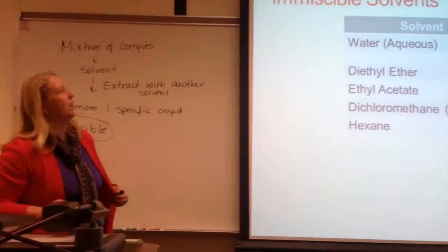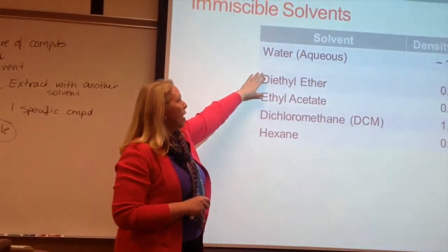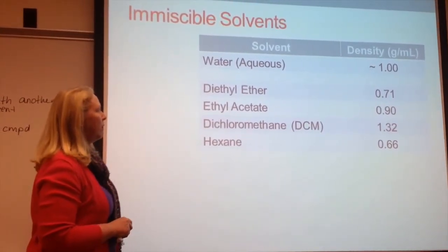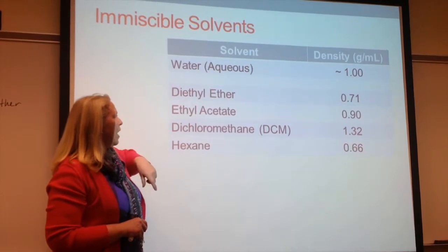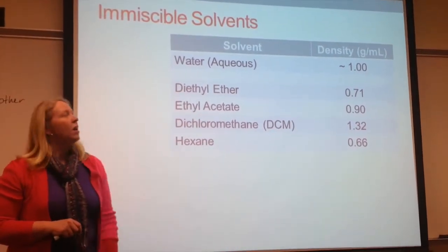We'll get back to this point in a second. There's many examples out there that won't mix with water. Here's just some common organic solvents that we use for this kind of liquid-liquid extraction. Diethyl ether, not soluble with water, or immiscible with water. Same with ethyl acetate. Dichloromethane is another common one, and hexane.